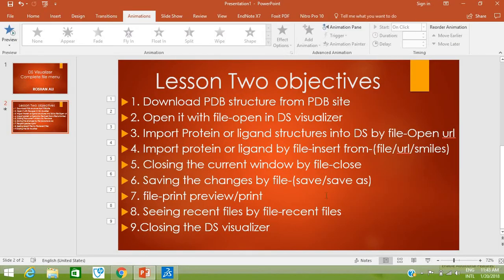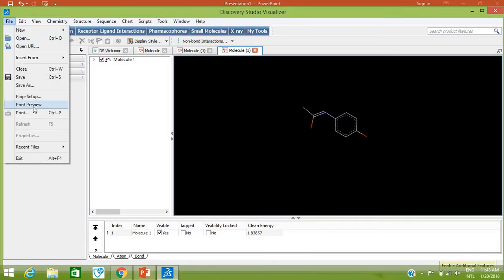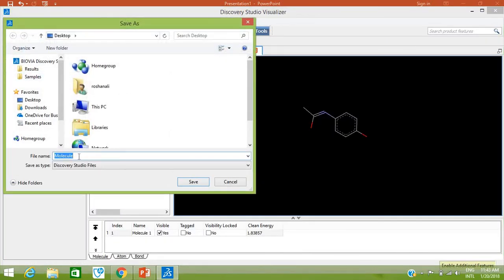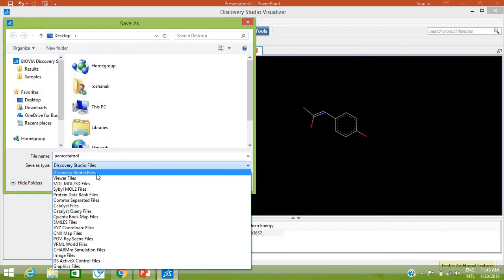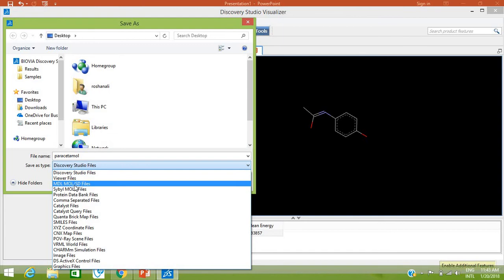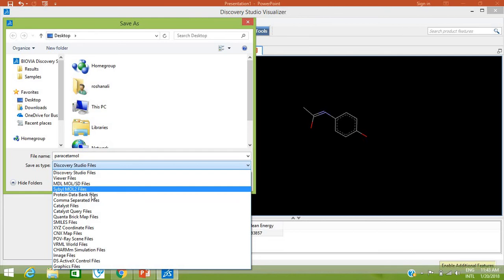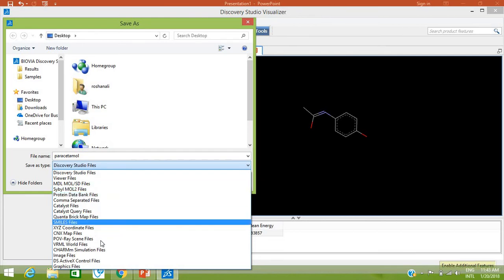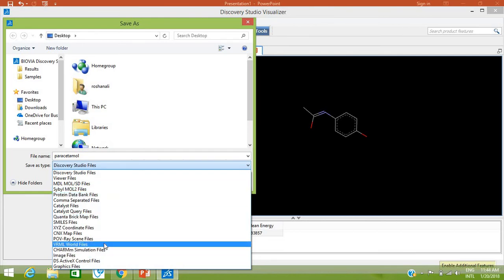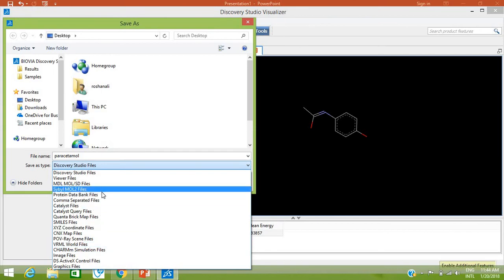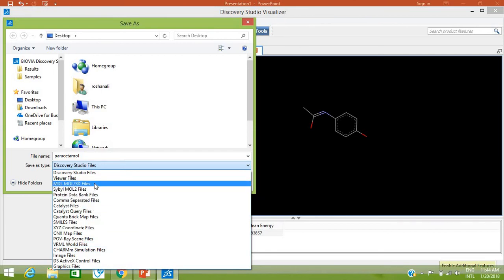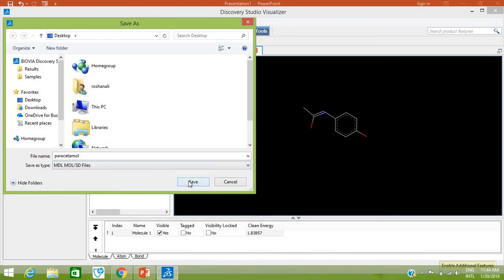Our next objective is saving the changes by going to File > Save or Save As. Click on Save and it will ask you to save the structure into a file. Type the name — for example, paracetamol — and select the format: Discovery Studio file, MDL Mol SD files, Mol2 file, Protein Databank format, etc. There are many formats available. I'll save it as an SD file on the desktop. With Save As, you can save with a different name like paracetamol_1 and choose a different format, for example Discovery Studio file format.